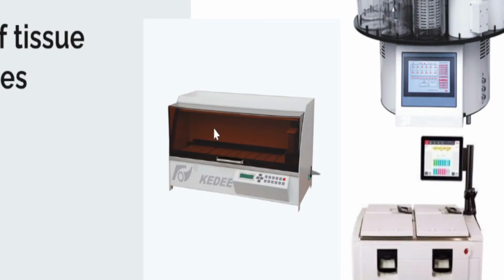And lastly is this one. This is a type of tissue processor where the tissues don't move in a carousel or get placed in a bucket, but rather they are soaked in the chemicals.